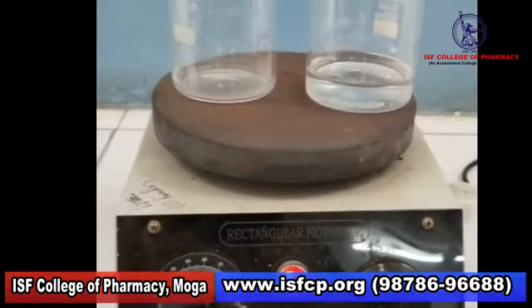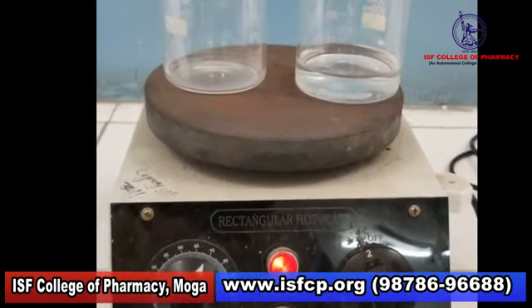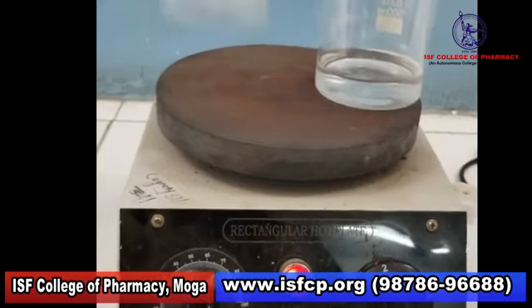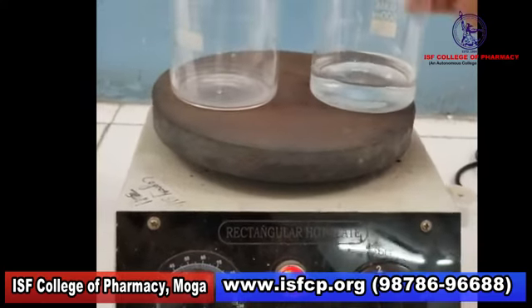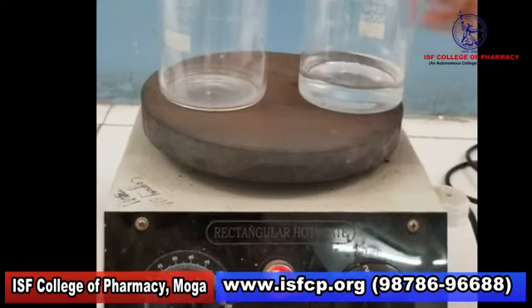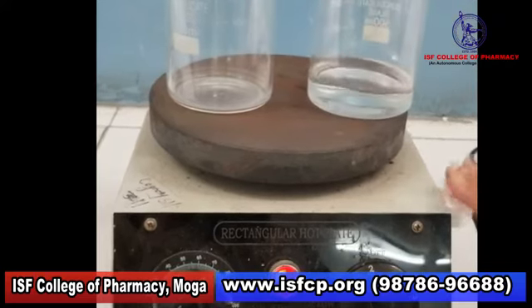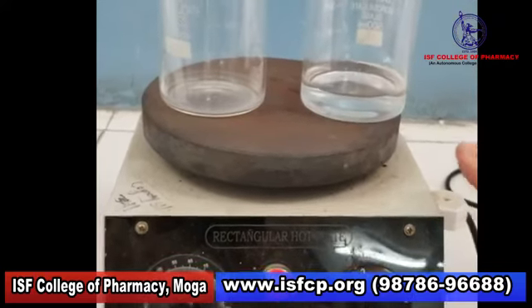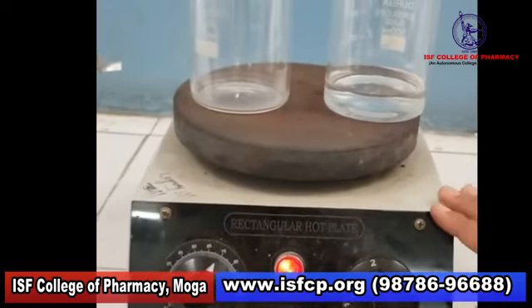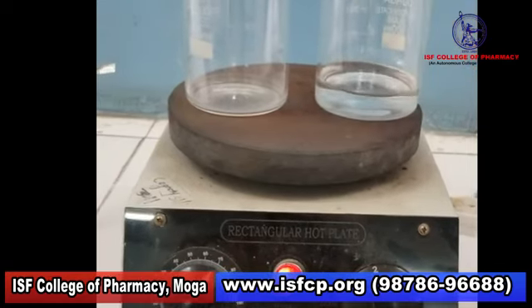Okay, now let us start preparing the herbal cream. First take two beakers, one for the aqueous phase and another for the oily phase. We have taken 75 ml of water, and all water soluble ingredients are to be put into this beaker, which is placed on the hot plate at around 70 to 80 degrees centigrade, so that the temperature inside the beaker is 70 degrees centigrade.